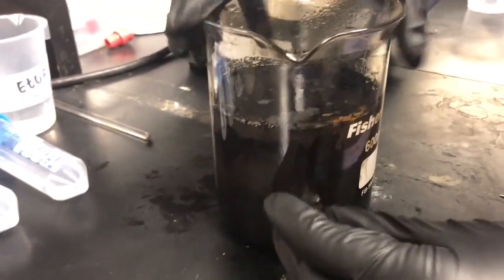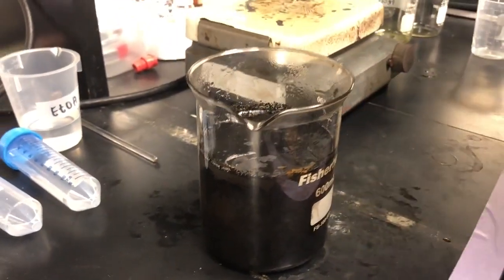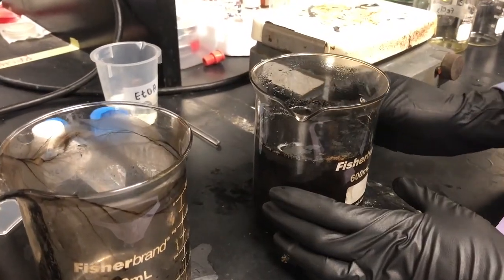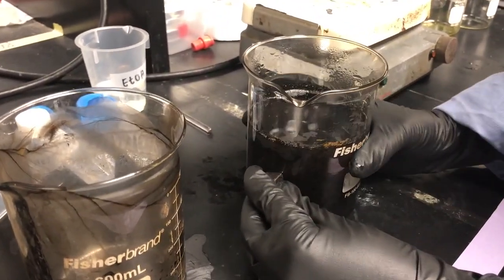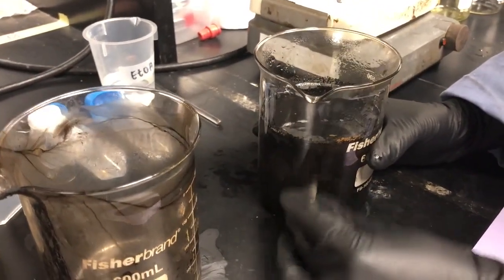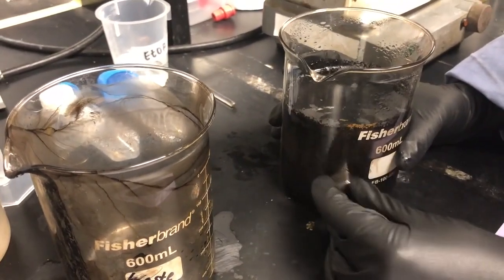So now, for all of these washing steps, what's crucial is quality, not quantity. If you lose even upwards of 25% per wash, you'll still have more than enough nanocrystals. And in fact, the nanocrystals that do come out with your solution, you'll see in just a bit, those ones are not going to be good for spiking behavior, which we're looking for at the end. So it's in your interest to go for quality, not quantity.